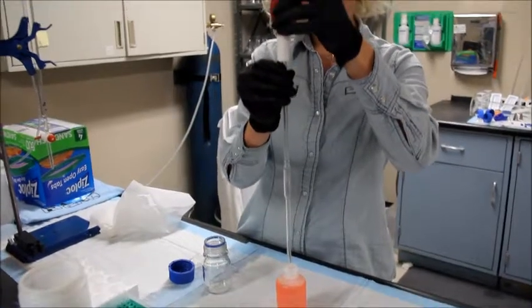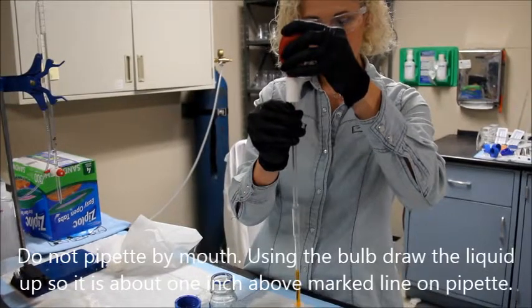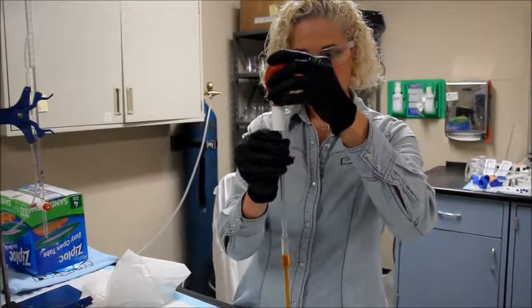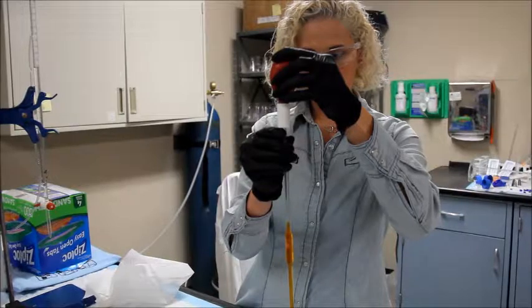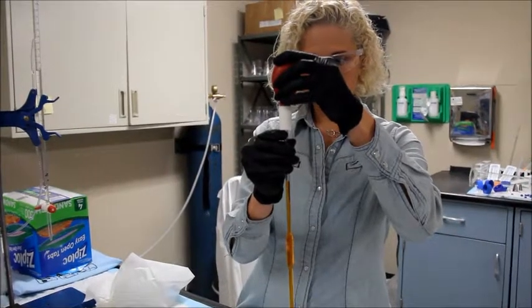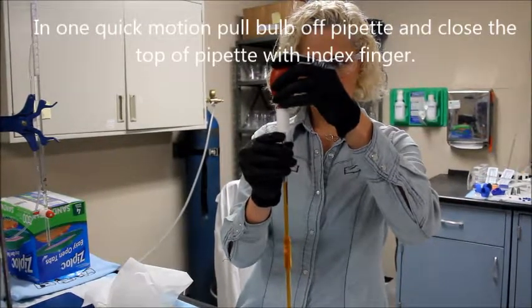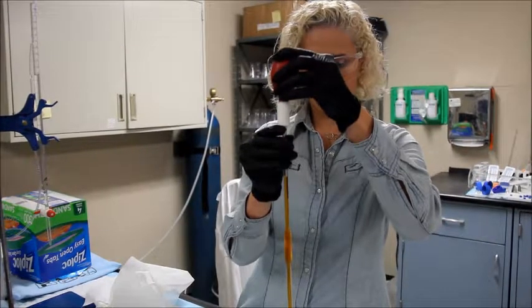Do not pipette this by mouth. Instead, use the bulb to draw up the liquid until it is an inch or two above the meniscus line. Then in one quick motion, lift up the bulb and cover the top with the tip of your finger that's holding the pipette.